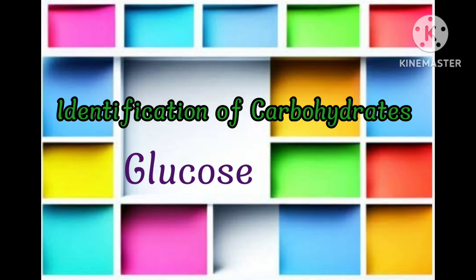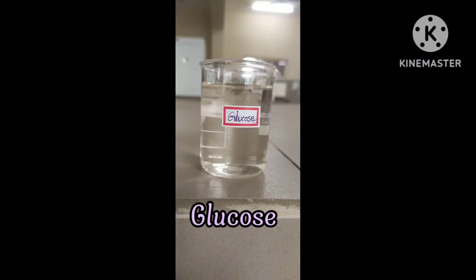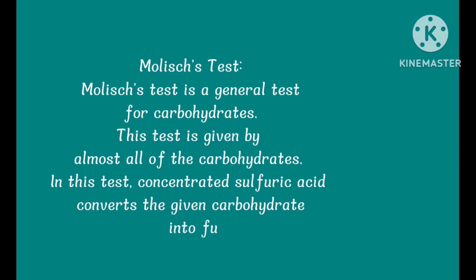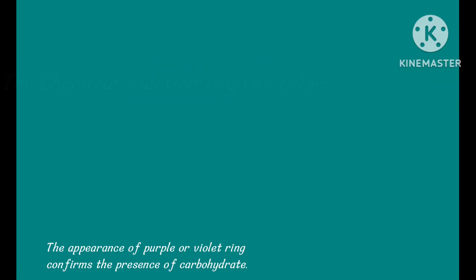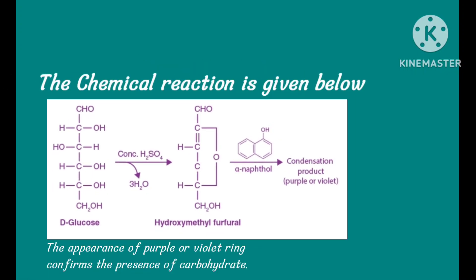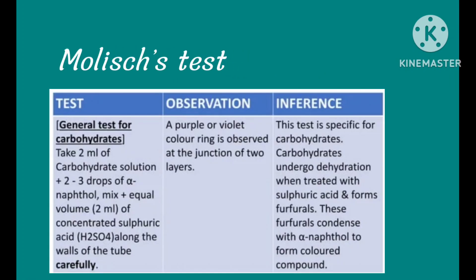Tests performed for identification of carbohydrates for sample glucose. Molisch test — it is a general test for carbohydrates, given by almost all carbohydrates. In this test, concentrated sulfuric acid converts the given carbohydrate into furfural, which then reacts with alpha-naphthol to form a purple color product. The appearance of a purple or violet ring confirms the presence of carbohydrates.